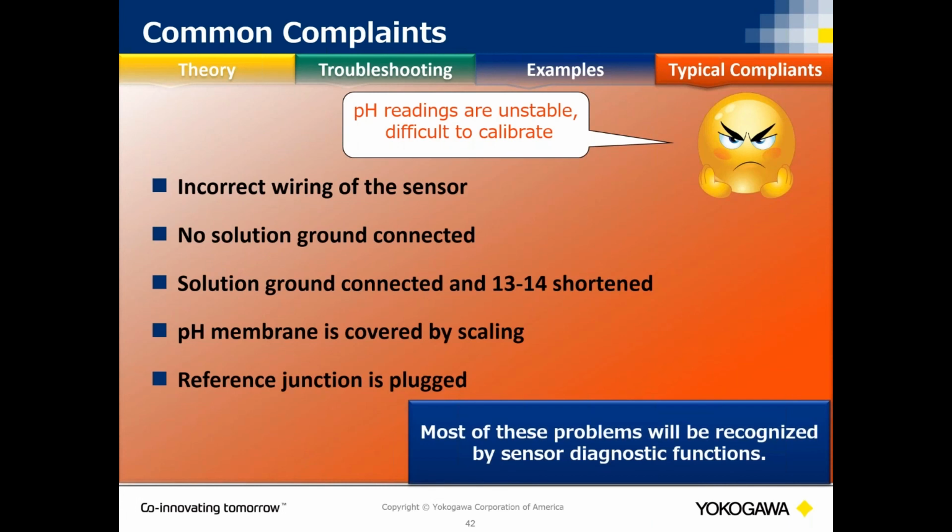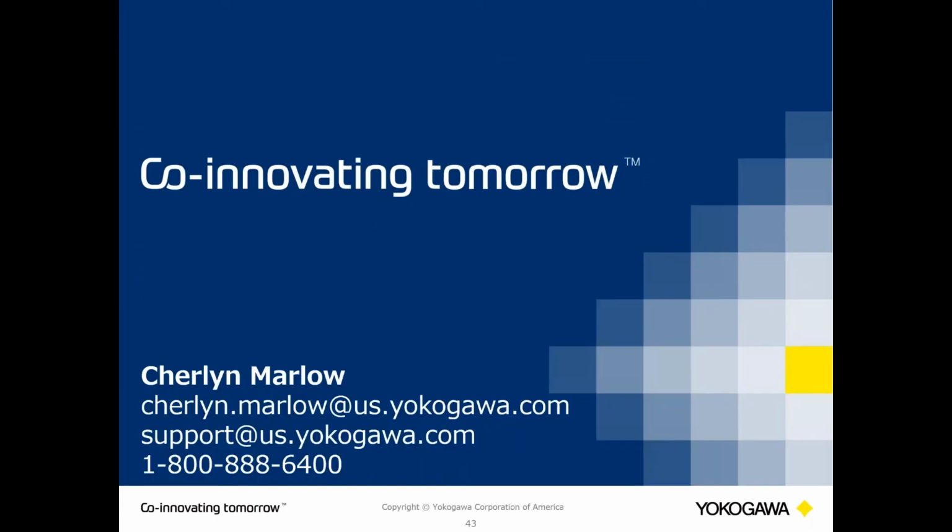And then scaling. And again, leave those alarms turned on in the analyzers for you guys, they'll help you. So that is the high level of what I have without going into too much detail.